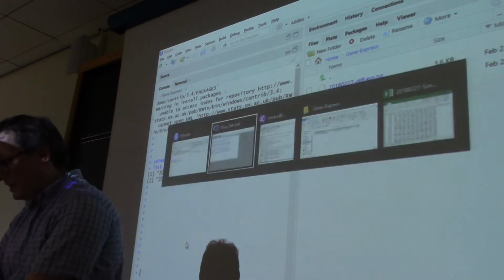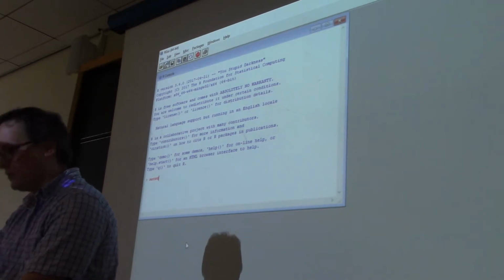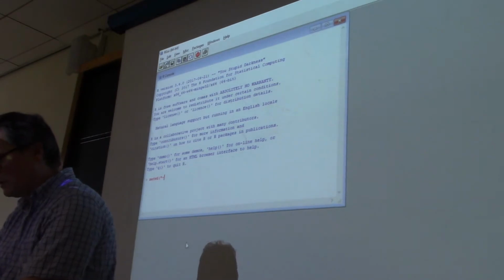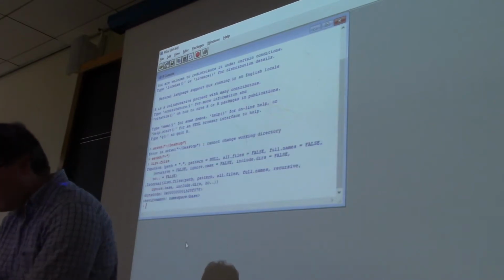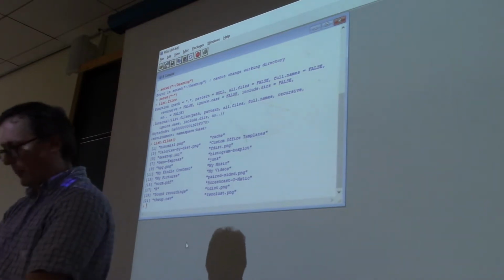Let me, so if I use set working directory in standard R, I'm going to have to give it my directory, that's going to be, I hope this is right. I could be wrong. Nope, that's not it. Can I just change to that? Yep. Okay.